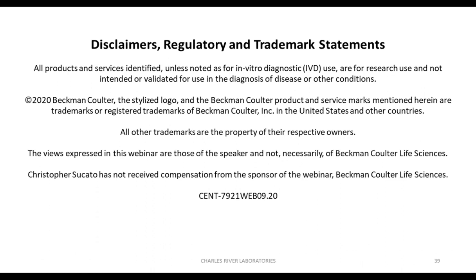If you can have titer levels that high, we only really need about 100 or 200 microliters to do a routine R&D level test, and that would get you empty-full characterization, the presence of any partials or any aggregates in the neighborhood of the empty and full species. Again, that's about 100 to 200 microliters, and that would get you duplicate analysis in a single centrifugal experiment.